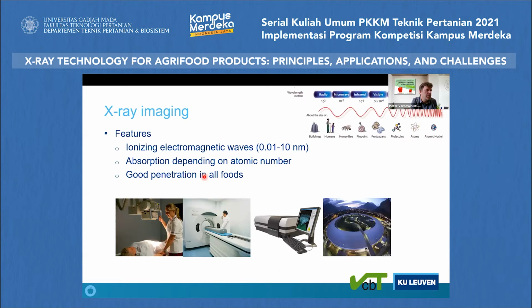So today, X-ray imaging is used in a wide range of applications. And first, we should think about what are the particular features of X-ray imaging that make it such an interesting method. First of all, they are, of course, electromagnetic waves, and they come in a range of the spectrum that is interesting because they are very short wavelength waves, making them useful for interacting with atoms and molecules rather than light, which has much longer wavelengths.